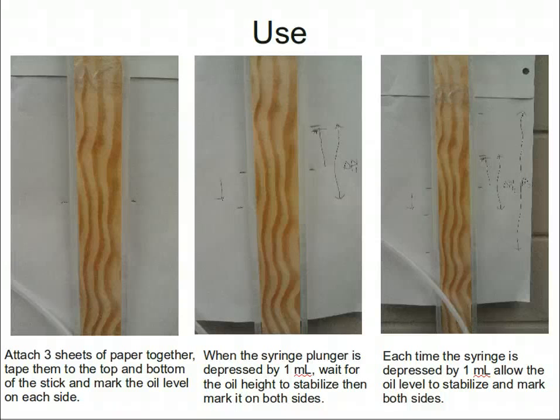Three sheets of paper can be taped together and taped to the top and bottom of the stick. The paper can be marked with the oil level to determine the change in pressure that occurs when the syringe is attached and the plunger is depressed. After each depression of the plunger to a new volume, allow a few seconds for the system to respond and settle. If the level does not stabilize, there's probably an air leak where the syringe is attached to the tubing.